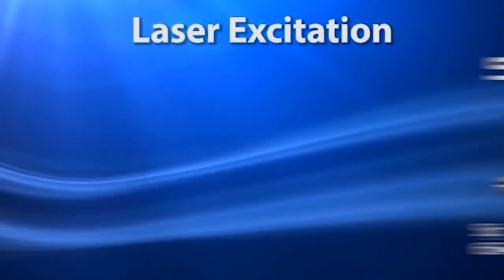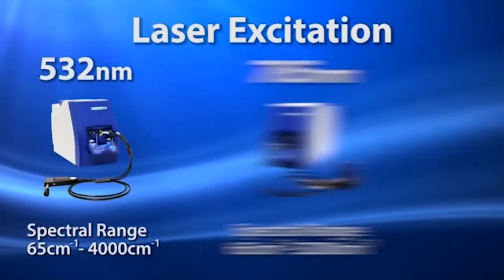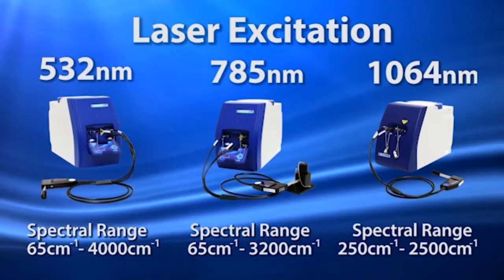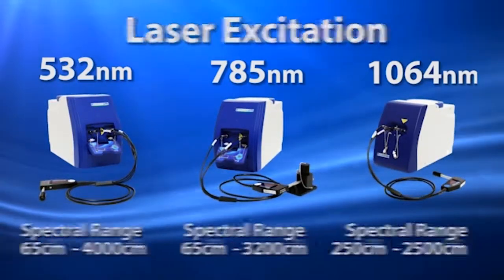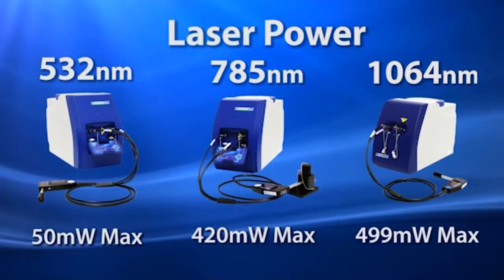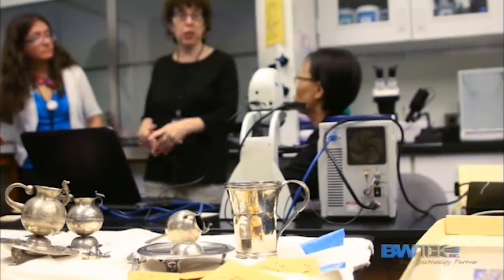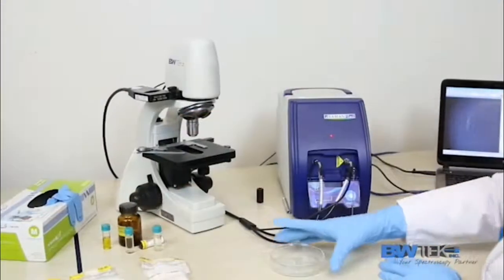With the best resolution in portable Raman instrumentation, the iRamen series also excels by having broad wavelength coverage that extends into the low frequency region. The flexibility of the laser power settings allows for measurement of even the most fragile of samples, such as cultural heritage artifacts and biological tissues.